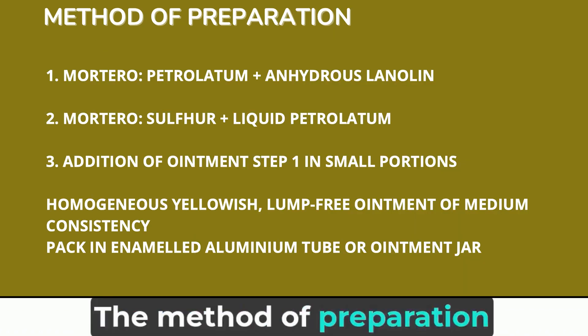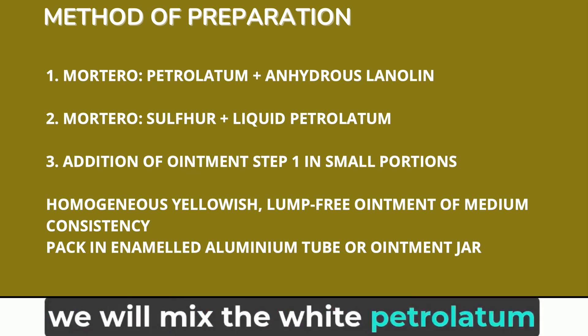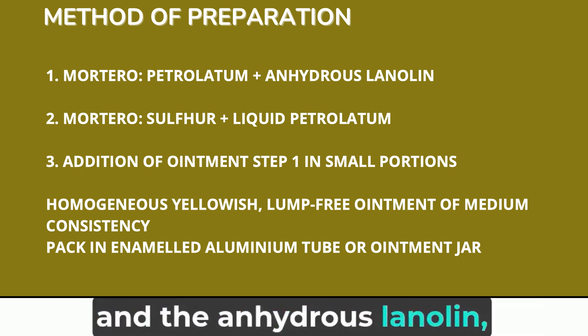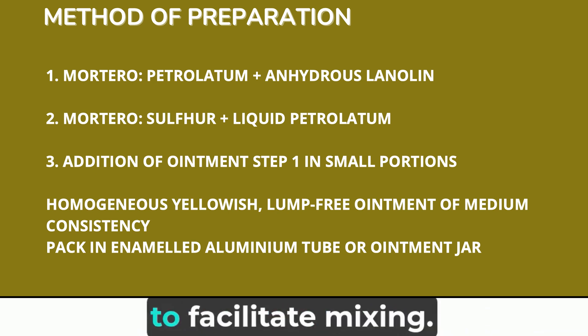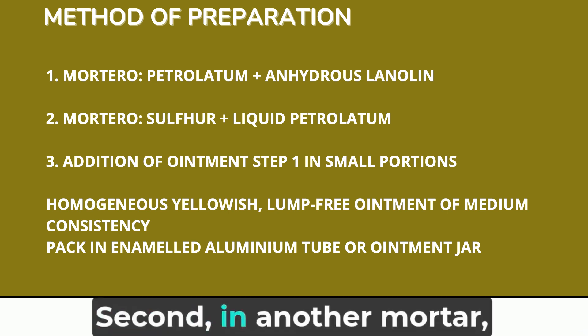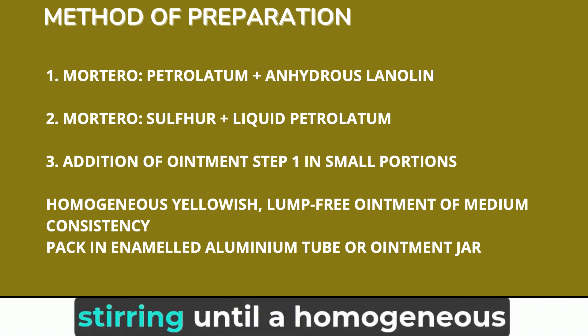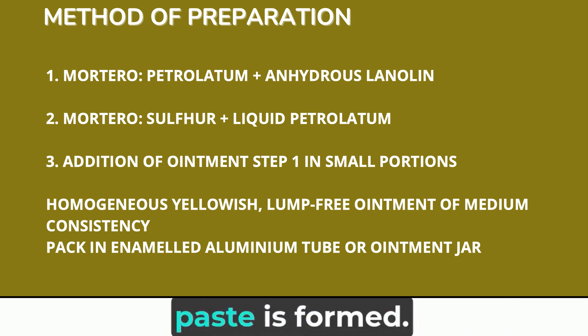The method of preparation would be as follows. First, in a mortar, we will mix the white petrolatum and the anhydrous lanoline, heating to 30 degrees to facilitate mixing. Second, in another mortar, we place the sulfur and add the liquid petrolatum, stirring until a homogeneous paste is formed.